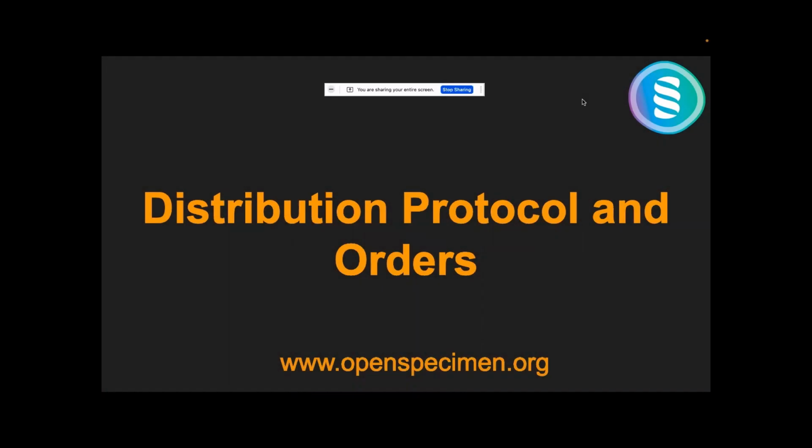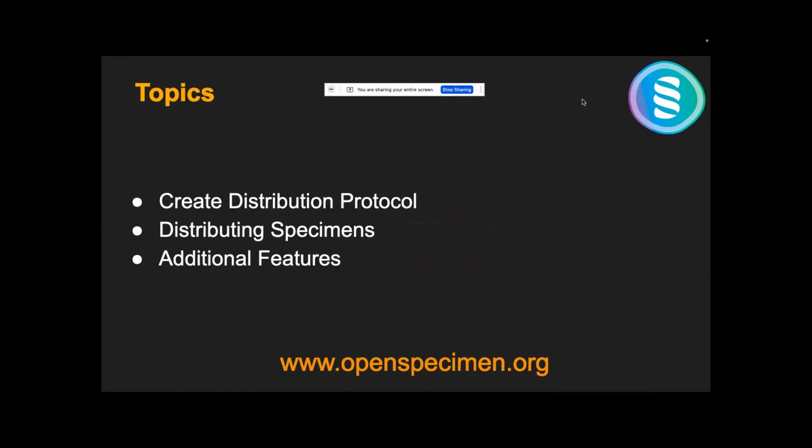Now today we are going to cover distribution protocols and orders. Basically how these two concepts work in OpenSpecimen, and more importantly we'll go over the common parts amongst all the use cases that you guys have shared over time. So these are the primary three topics that we are going to cover.